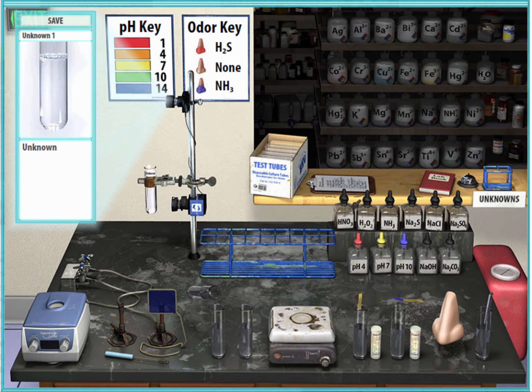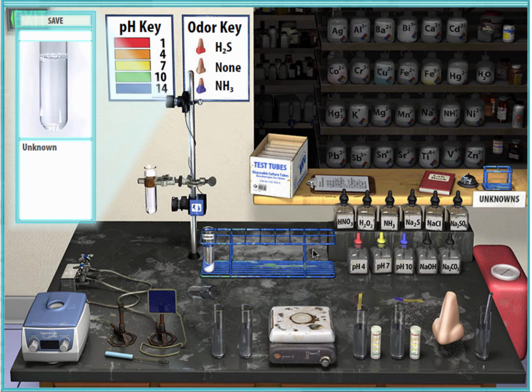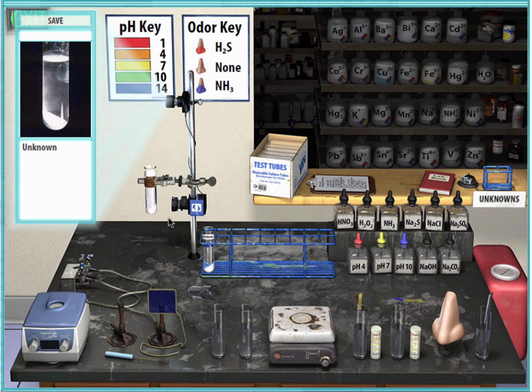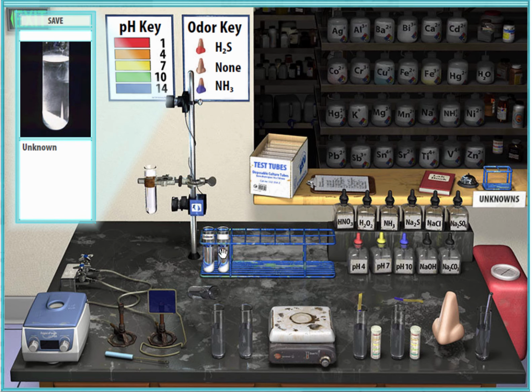We'll do the same kind of thing. We'll acidify it. We'll check it with the sulfate. There's our barium. We'll come off like this way, and we'll replace that. Now we'll raise the pH up. It's got strontium as well, and so we'll decant that. And there's our barium and strontium.